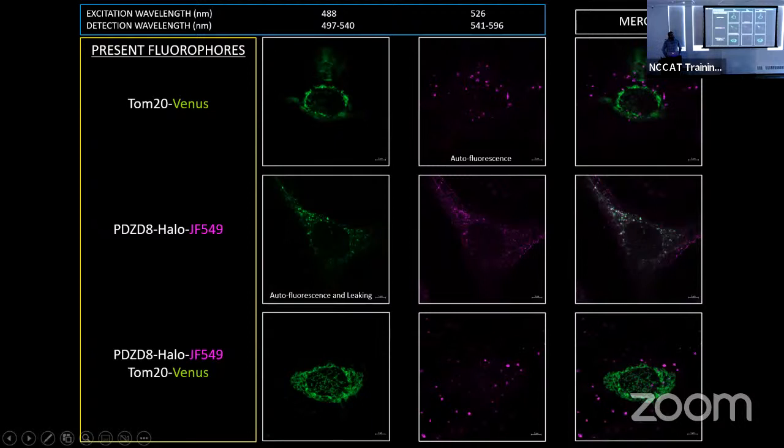So that's a discussion that you're either going to have internally or with your collaborator. In my case, the biologist was my collaborator, and we had this discussion back and forth. You want it to be native, so overexpression is not an option. But you want to do structural biology, so you need numbers. So I think the sooner you do overexpression, the sooner you'll get results, especially if you're milling. You're going to end up with a tiny slice of your cell, and the signal is going to be weak. You're not going to have that many targets, so you have to overexpress.